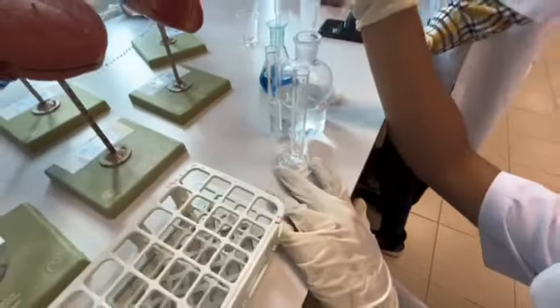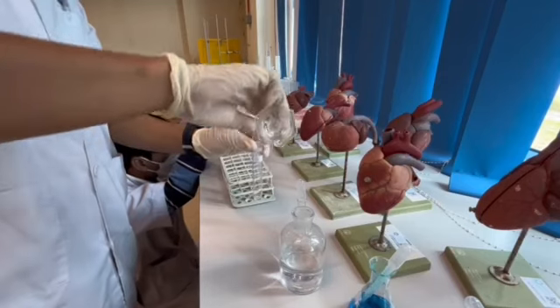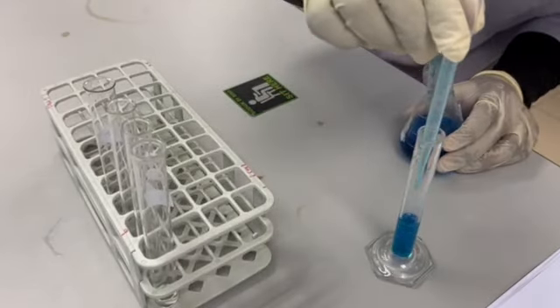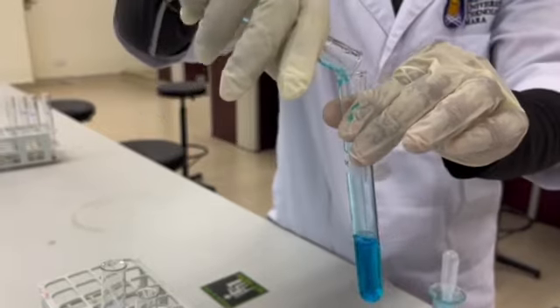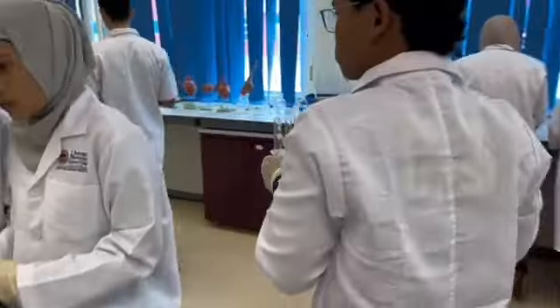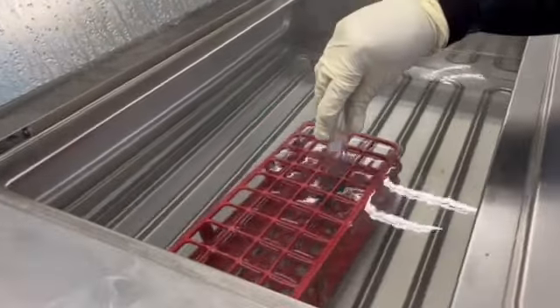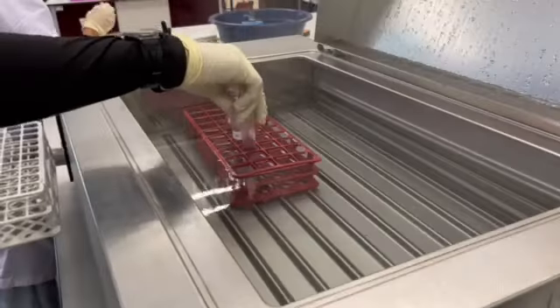Add 2 ml of sucrose 2%, glucose 2%, maltose 2%, and starch 5% into each test tube separately. Then add 5 ml Barfoed's reagent into each of them. Soak them for 30 seconds in boiled water.